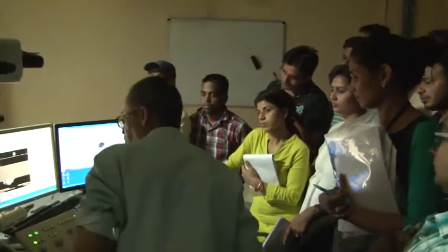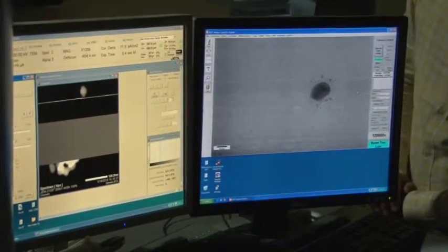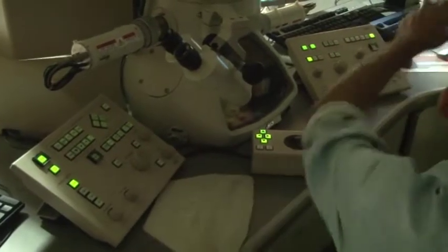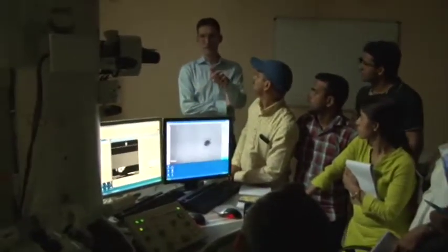Had it been there, one way in which it could have been corrected is, we go to this diff stig, and here I see that there is objective stigmator. I press this button, and then using these bottom knobs, one could try to make that fringe uniform or homogeneous. Okay, so we are going to talk about the Fourier transform to show how to correct for the astigmatism, because this is a coarse alignment of objective astigmatism.